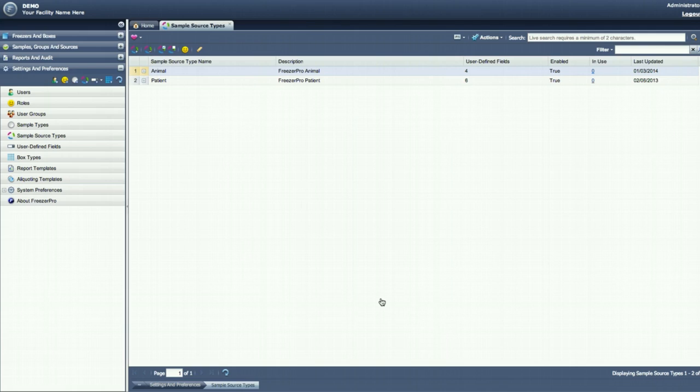This concludes the General Configuration Managing Sample Source Types video tutorial. Up next, we will discuss managing user-defined fields.